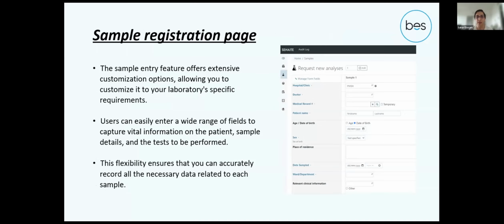I'm going to talk about the sample registration page very briefly. SENAITE sample entry features offer extensive customization options, so it's allowing you and all of the scientists to modify it based on your laboratory's specific requirements. It means that you can actually set up the system to match your unique requirements and the workflow.